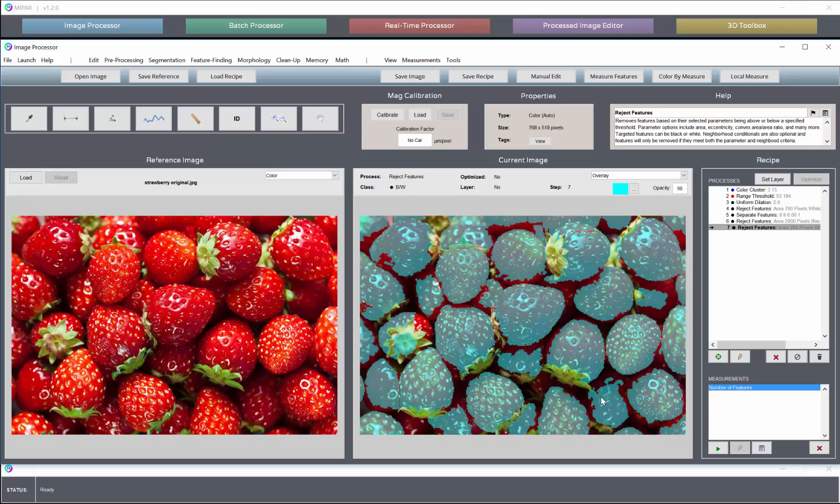There are a couple of issues I do see. We have misidentified this stem as its own berry, separate from this one. I'm confident that with a bit more time we could prevent those errors.